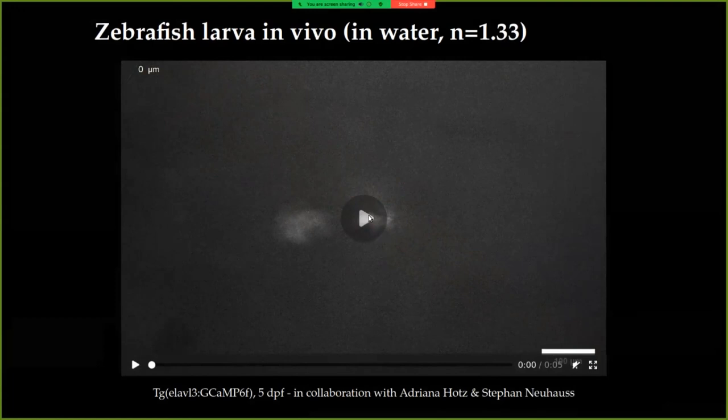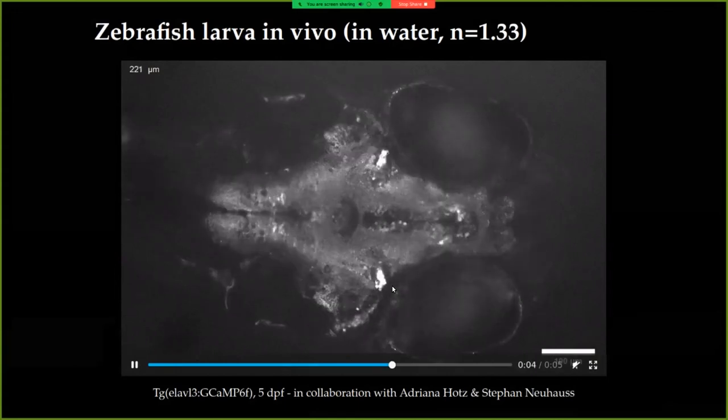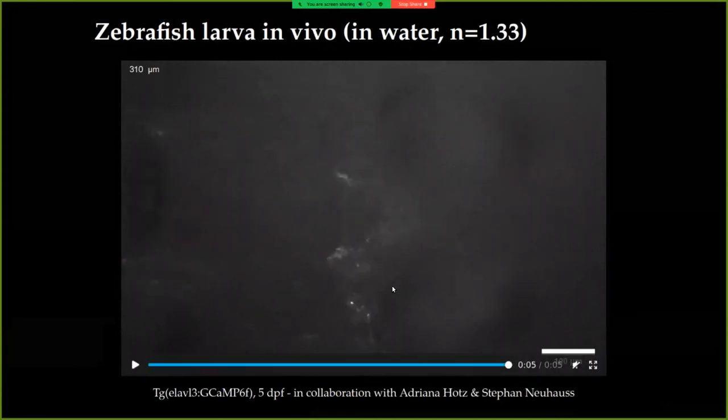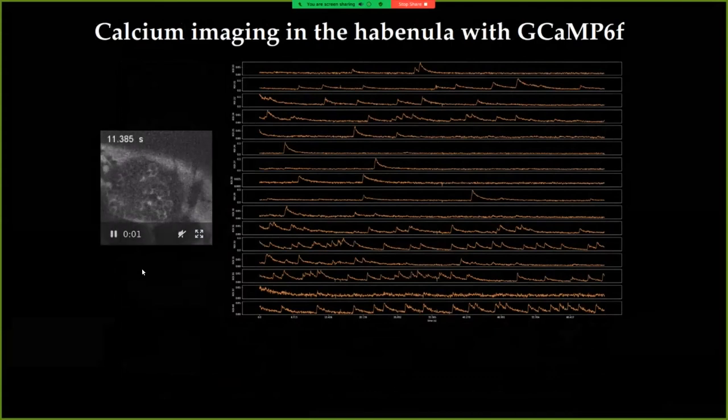But because it's a multi-immersion objective, we can also image live samples, so in this case this is a zebrafish larva imaged in water, so this was just a stack showing the brain, and then we can select a ROI for calcium imaging at high frame rates. And then we can see the neural activity, in this case, imaged with the calcium indicator GCaMP6f, and we can recover nice, very standard calcium transients, similar to what you could do with standard water immersion objectives.